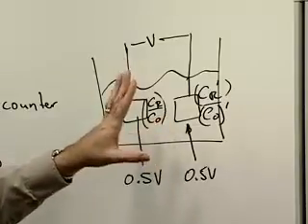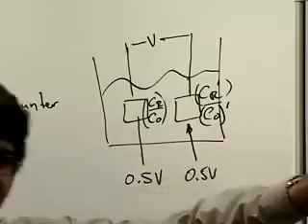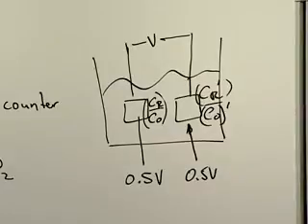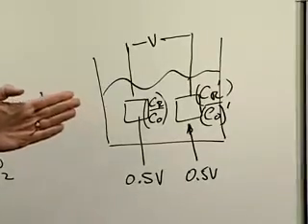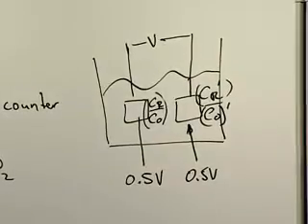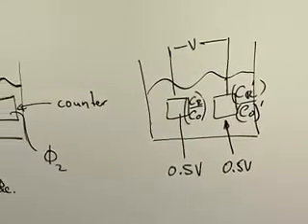Now, having said that, there are plenty of reactions, especially if you go back in the 1960s and look in the literature, where people did electrochemistry, and all they did was they took two electrodes and a battery, usually a lead acid battery, a car battery, put it together like I'm suggesting here, and they made something, and they made what they wanted, presumably. You know, they didn't make 29 different products, they made one thing.